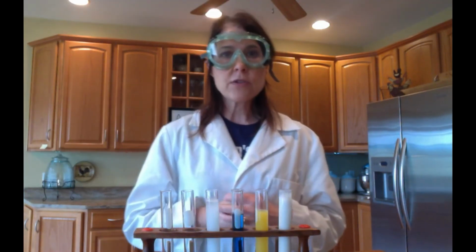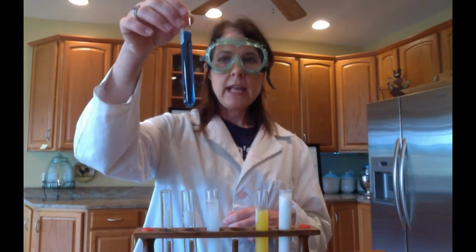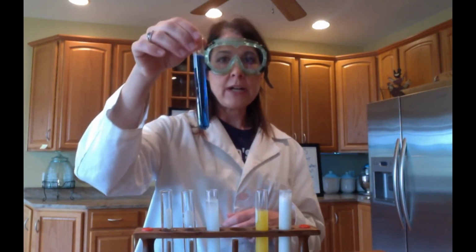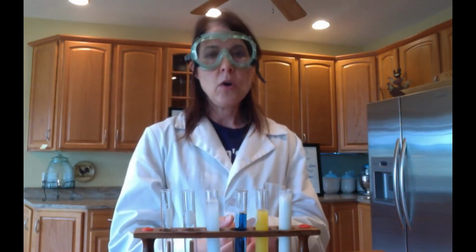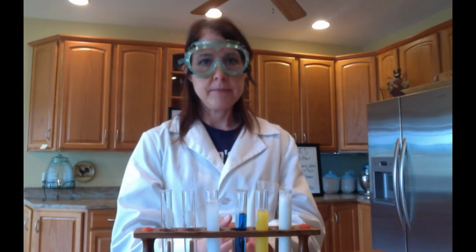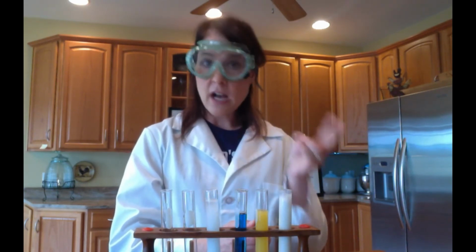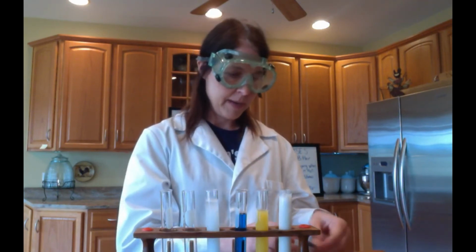Our next household substance that we're going to be testing is blue, and this is toilet bowl cleaner. Now, this can be quite caustic, so I'm not going to touch it with my hands. What do you think toilet bowl cleaner would be? We don't want to taste it to see if it tastes sour. I don't want to touch it to see if it feels slippery. So let's go ahead and test it with our litmus paper.